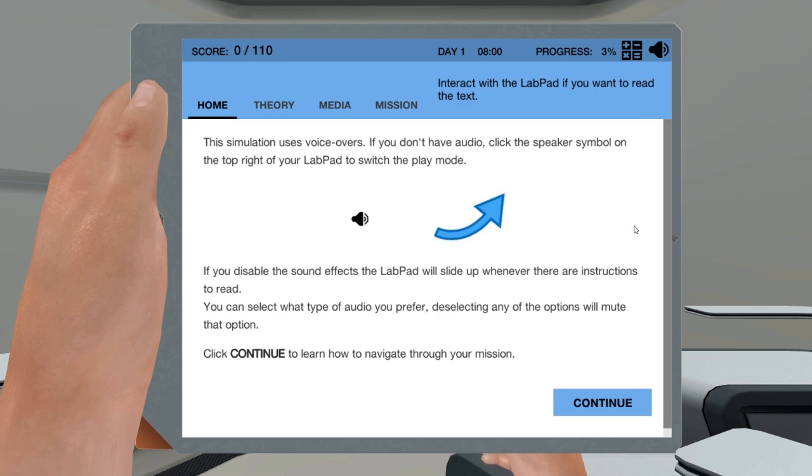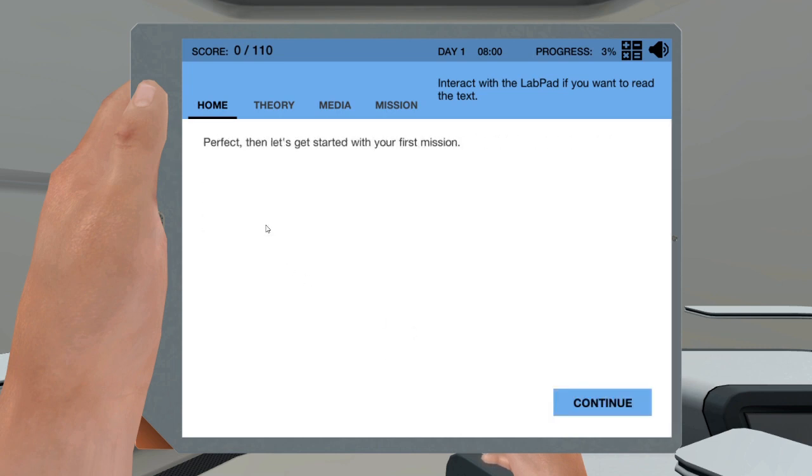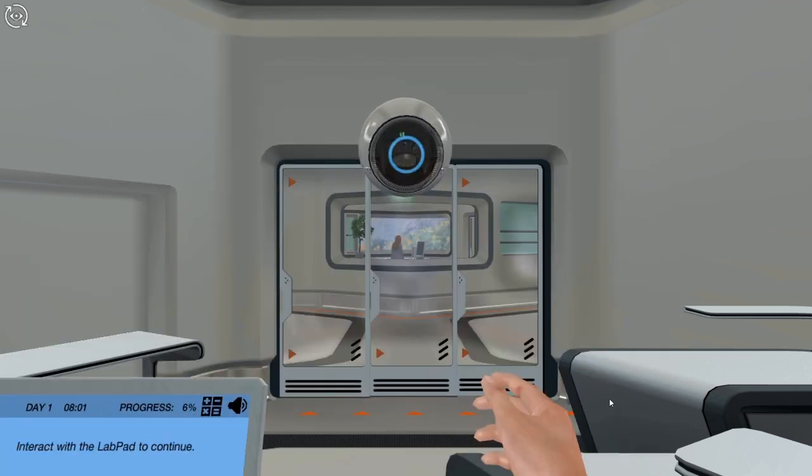It provides us the normal information regarding how to navigate in the lab, and this tab will always be there throughout our simulation. As I already know the working, I will not waste much time. The first-time user can definitely go through the contents and how to operate the labs. They can proceed with it. So now I will click on next and we will proceed.